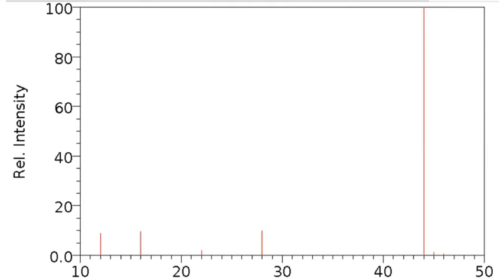Okay, so you look at the heaviest one to find the whole molecule. So the whole molecule has a mass of 44. By the way, I think in the last slide I might have said the mass wrong for that heaviest peak, but I labeled it.